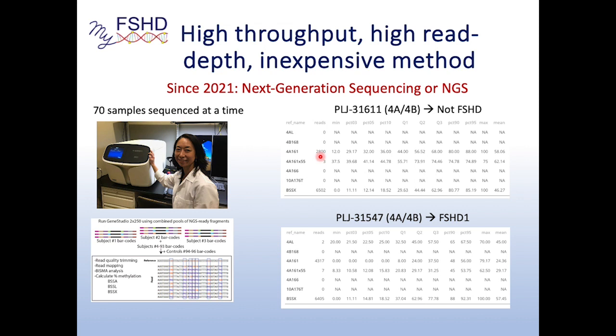And the computer actually sorts out, based on little sequence variations, that all of these are unique. So you assay 2,800 different cells from your cheek. The low level is 12% methylation. The high level is 100% methylation. This person's AB. So even with a single chromosome A, you can be between 12 and 100. That's the kind of data that this depth gets you.